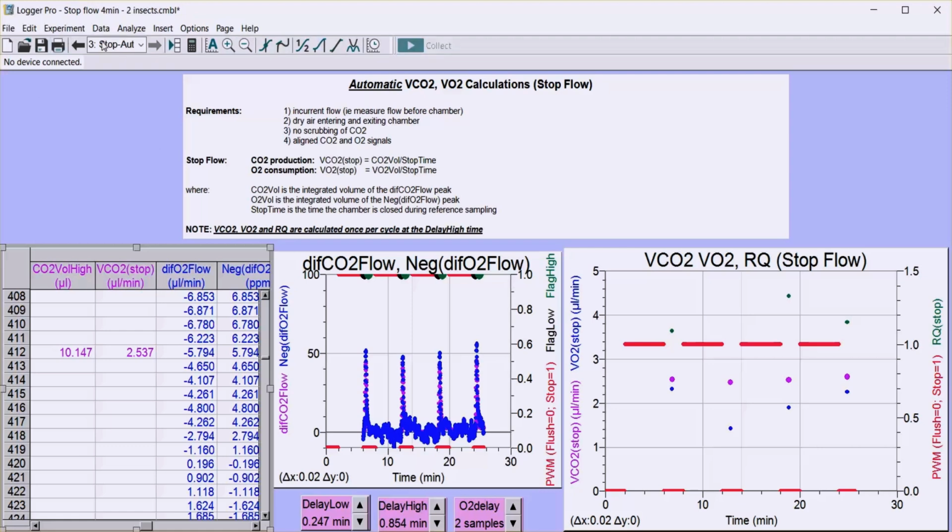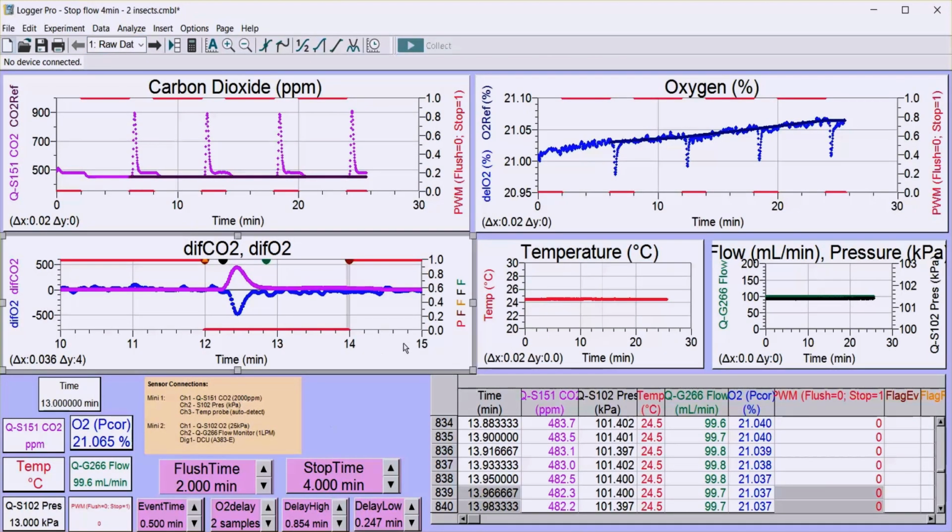So once you've determined that these particular parameters are going to work with the setup that you have in place, then you can proceed to start your full experiment with these parameters in place and collect your data. We recommend that if you're doing longer runs, that you save your data periodically, so that if there's a power outage or some other situation that may result in software being stopped or hung up for whatever reason, you don't lose your data.